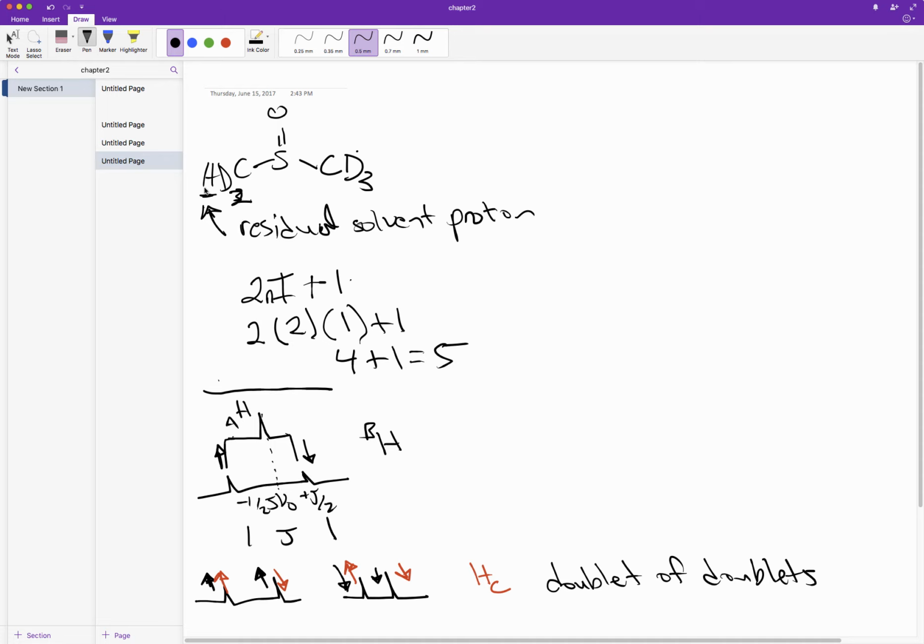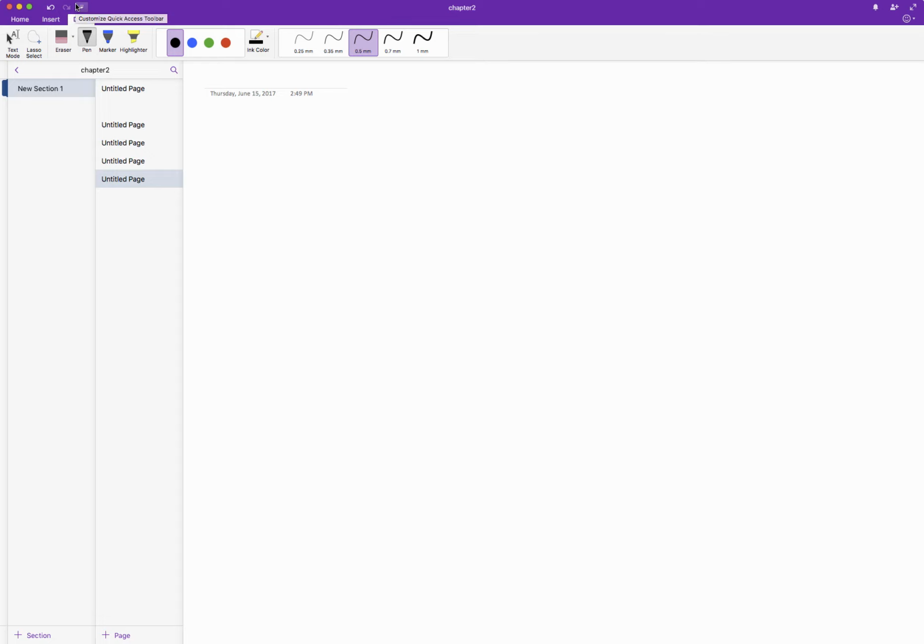Now, when you get these splitting patterns, I showed you that you have the Pascal triangle, which predicts the multiplicity and intensities of your peaks. Oops, I forgot one here. So you got the doublet, you got a single peak, a doublet, then the triplet, and then the quartet. Okay, so this is for the case we call weak coupling, and this is what you see in most books.